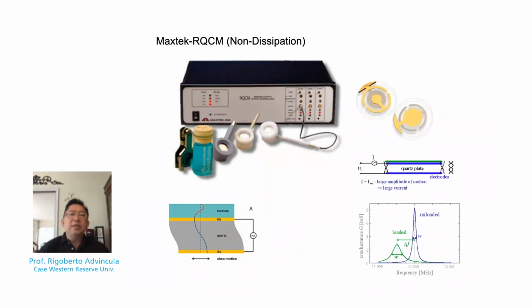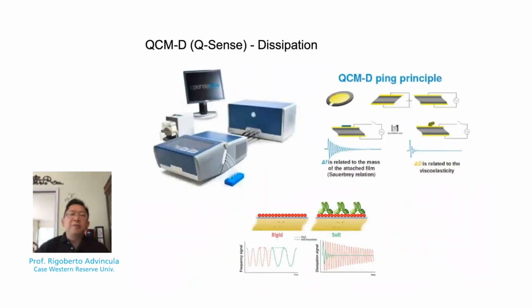However, a QCMD is a more expensive variation because of the flow cell and the experimental configuration, as well as the data analysis package that has been put to it, or simply a black box approach, which is quite popular with people who don't want to dwell with the configuration, but totally adjustable in parameters.